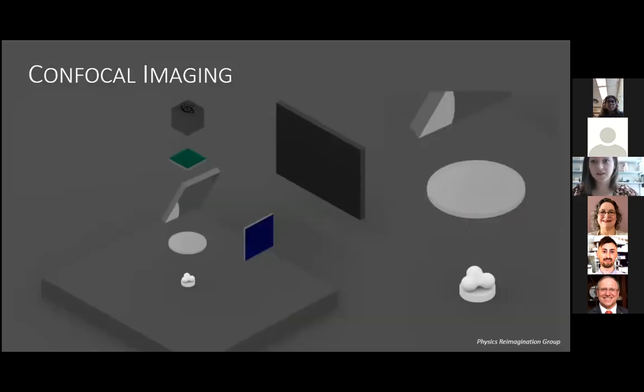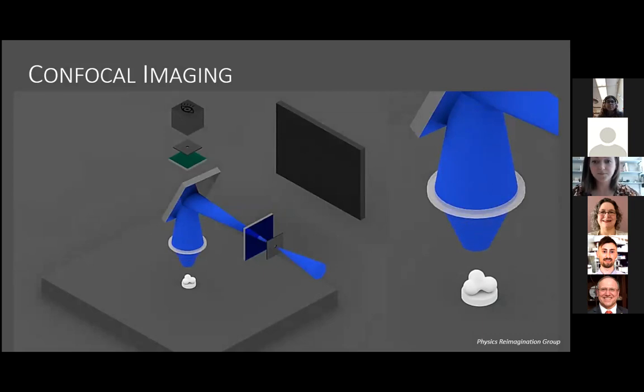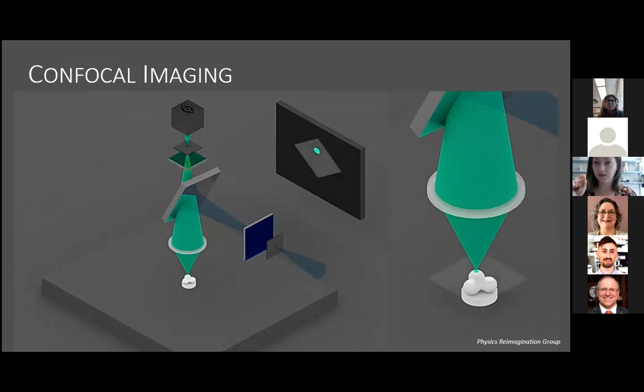And the way that this works is very similar to a traditional microscope. However, you have the introduction of something called a pinhole. So you have a pinhole that helps focus the light that is being excited onto your sample, and you're able to illuminate a very specific part of your sample in X, Y, and Z. So you have again, a sample that has a green fluorescent protein, so it emits green fluorescence. And then that light is also gone through a pinhole. So instead of having a large section of your sample illuminated, you have a very specific section of your sample illuminated, and that's increased resolution.